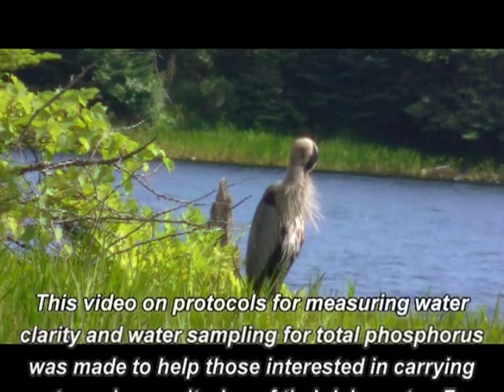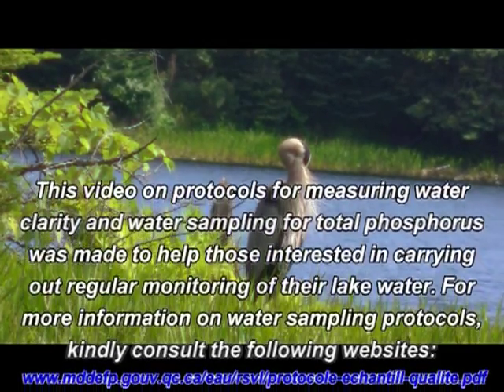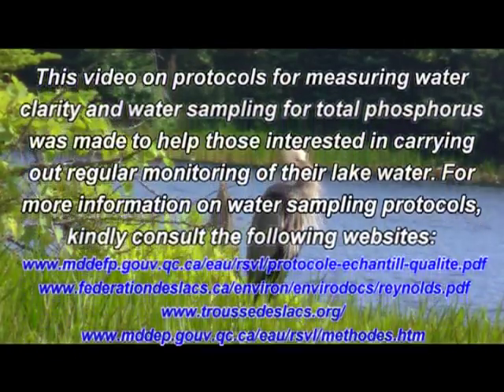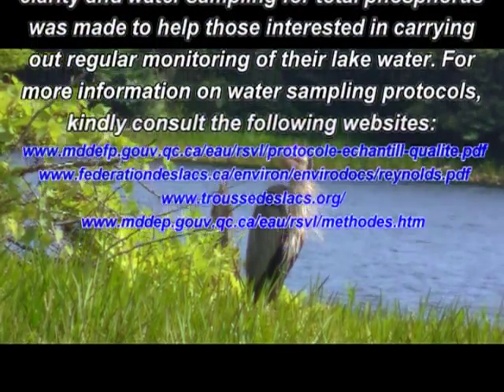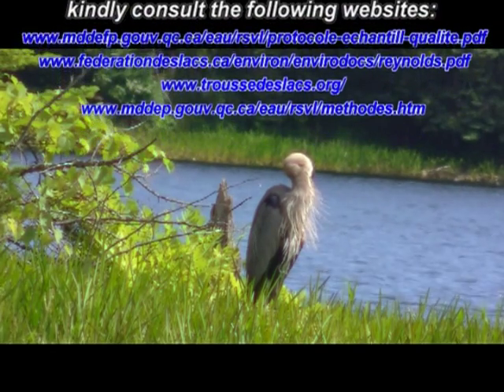This video on protocols for measuring water clarity and water sampling for total phosphorus was made to help those interested in carrying out regular monitoring of their lake water. For more information on water sampling protocols, kindly consult the following websites.